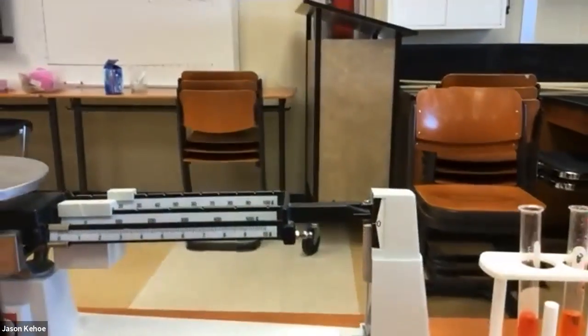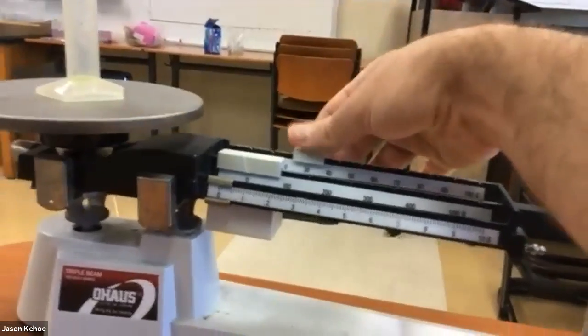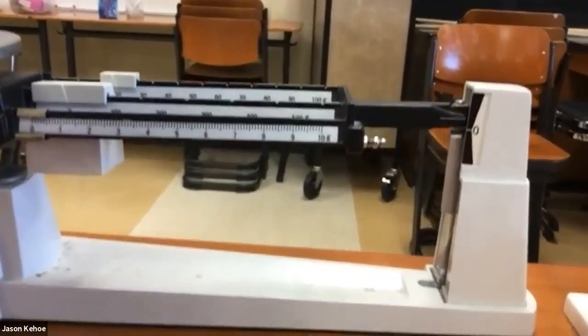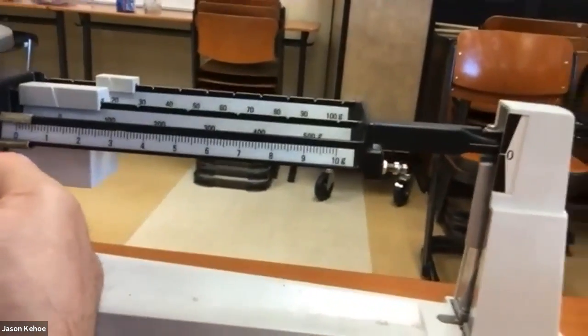Let's see, that's really close, but not quite. And at 30, it popped down. So now we move it back to 20. So now we know this is somewhere between 20 and 30. And finally, the ones place slides freely.